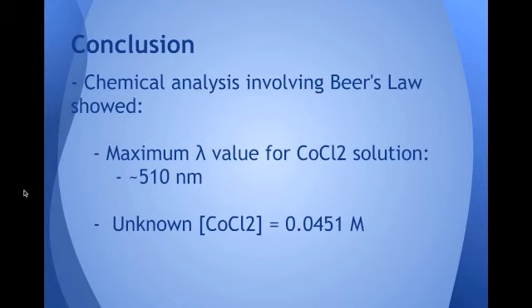By looking at the experimenter's data and the class data, Beer's law in this experiment tended to have a decent level of precision and accuracy. However, this experiment was prone to various errors which skewed the data. Many times, the least squares regression line for a set of different concentrations had a high correlation within its own trial, but when compared to the other data from separate trials, the results often varied.